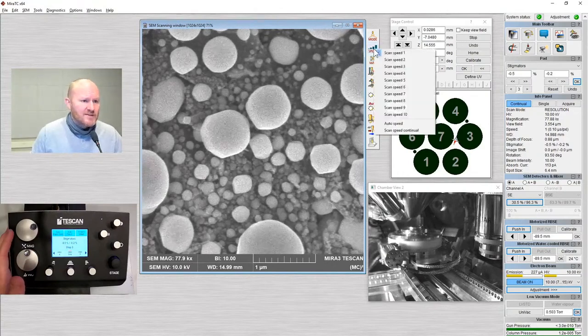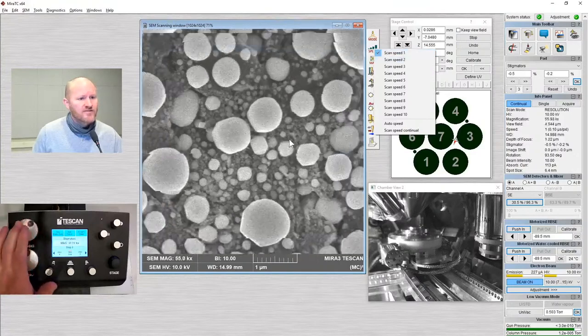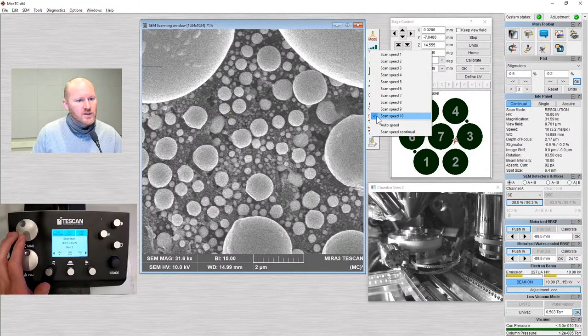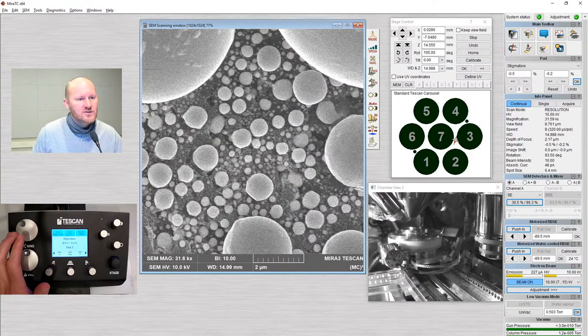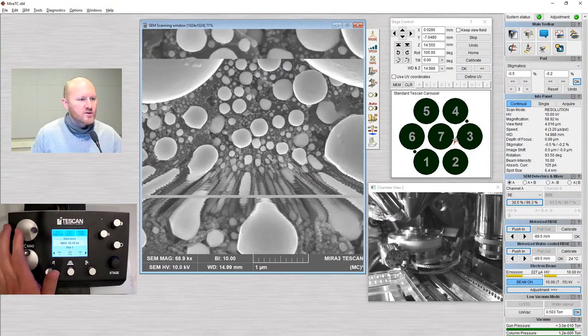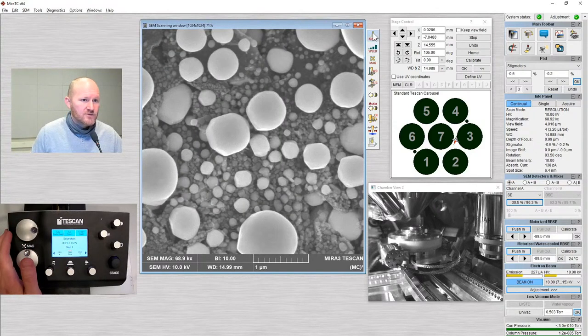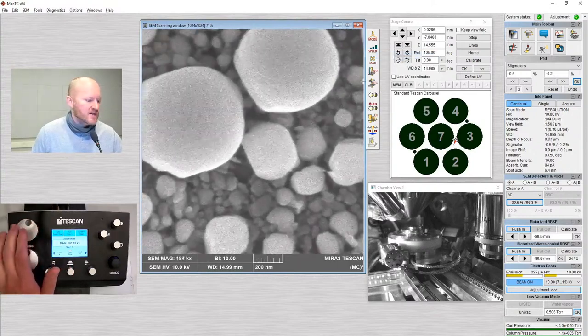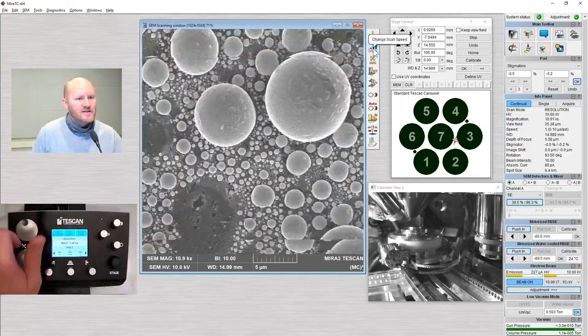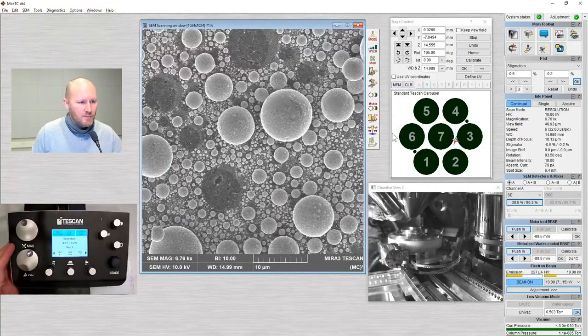We also have a scan speed function. Scan speed 1 operates very fast; scan speed 10 scans painfully slow. As we scan slower, we give the detectors more time to collect signal — increasing signal to noise ratio, at the cost of slower refresh time. I often do my alignments at a very fast scan and navigate the sample using a fast scan. When I find an area I'd like to capture, I'll go to slow speed. For this specific sample, scan speed 6 is a good place to be.